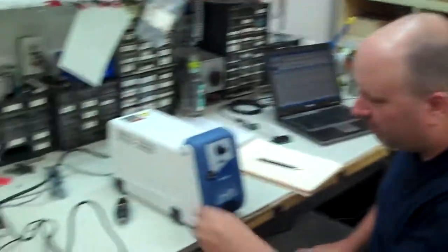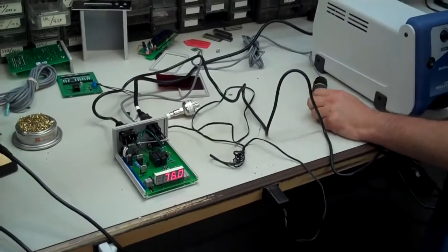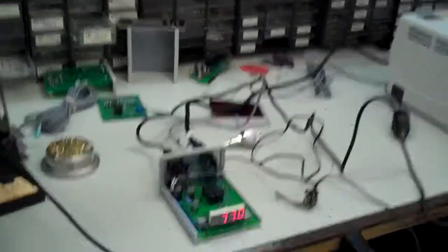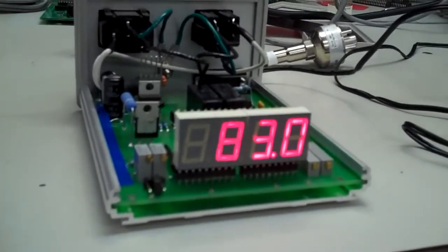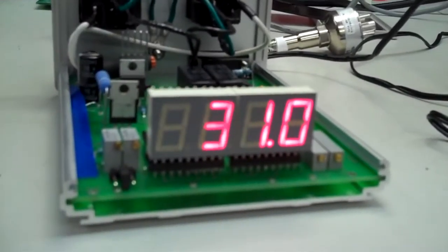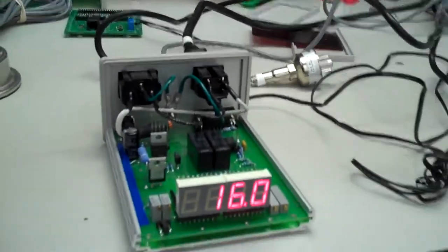Here is a Digivac solution to controlling your pump. The customer requested 252R pump turn on. Here's our model 200 with two controls on a simulator. We're going to go down the simulated pressure, down, down, down, pump is on.